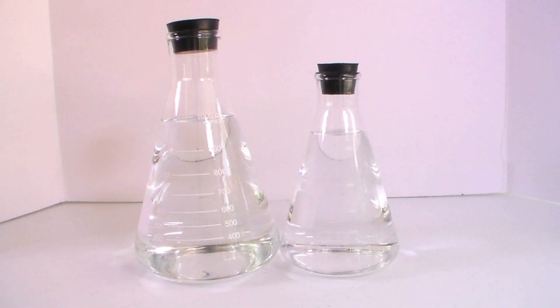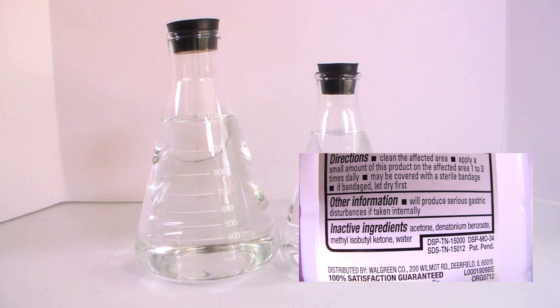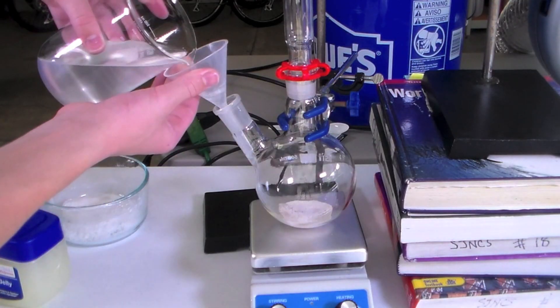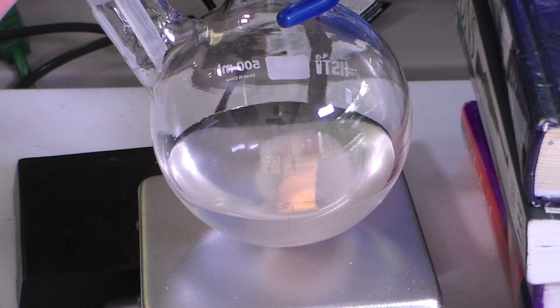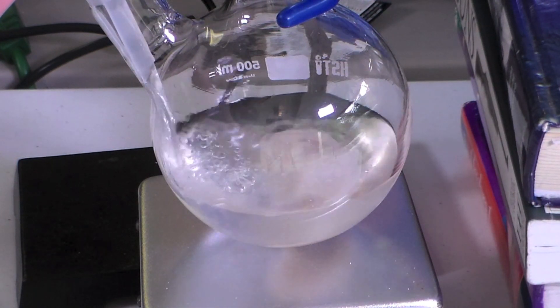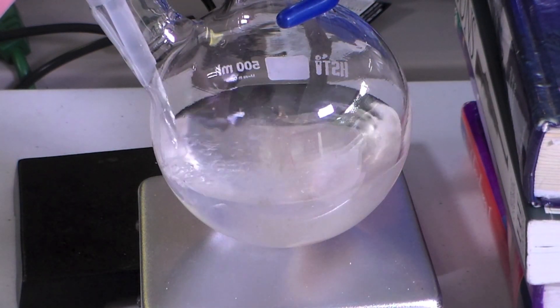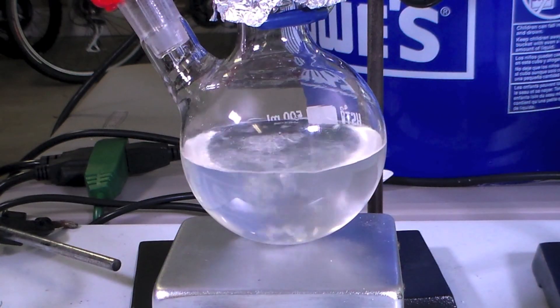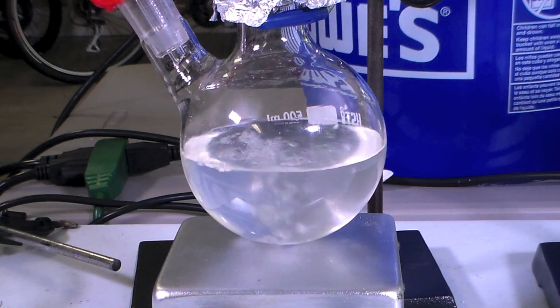Since my ethanol only contained a few percent acetone, I did not fractionally distill all of it and only distilled about 200 milliliters for demonstration. If you are okay with acetone contamination, you can go straight to the simple distillation and just distill off the ethanol-acetone mixture from the magnesium sulfate. In the end I was left with about one liter of ethanol containing a small amount of acetone contamination.